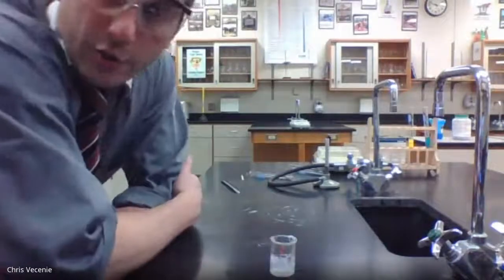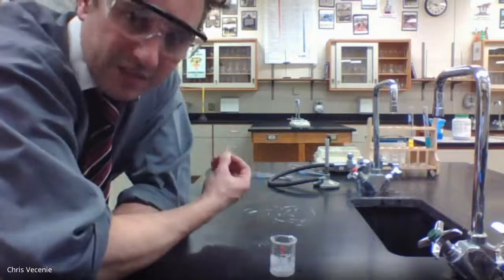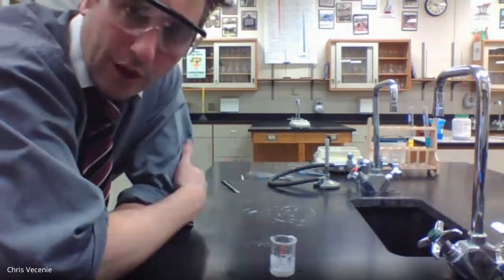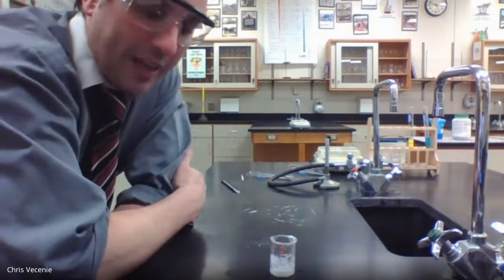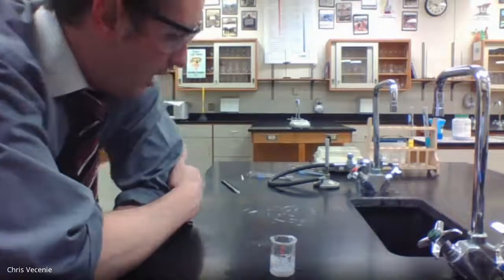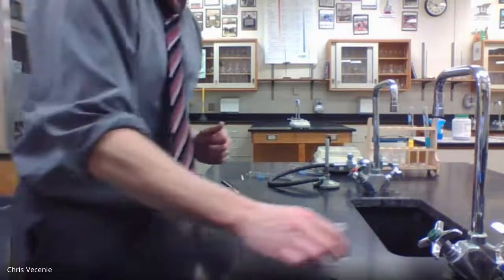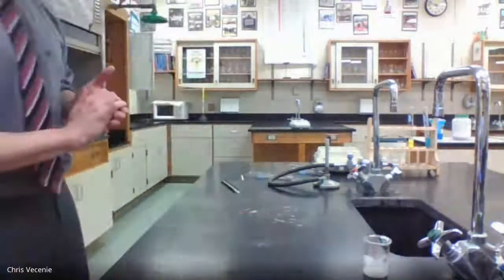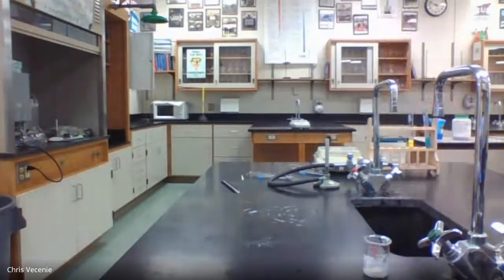Your first observation for 4B was the pH of 6, 5, 7, however close you thought it was. And then your second observation is that the pH became 8, maybe even 9. So there's experiment number 4A and 4B. Last but not least, we need to do experiment 5, and we need to observe our experiment 1.